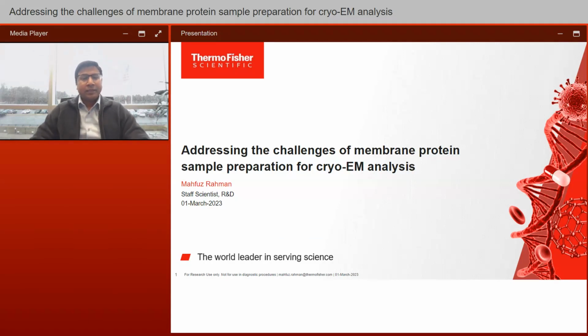During my PhD and postdoctoral training, I worked with several challenging membrane proteins. Based on my experience, I will discuss the power of cryo-EM and some challenges related to cryo-EM sample prep and a simple sample optimization method.